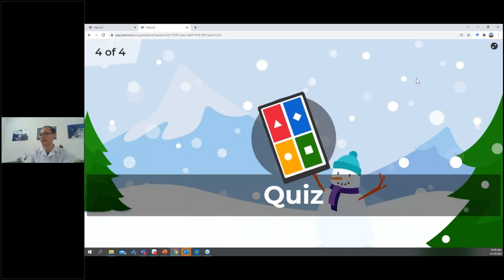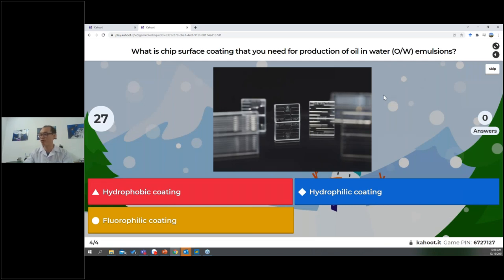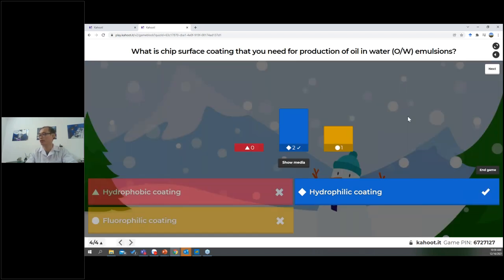Okay, final question. What is the surface coating that you need for production of an oil in water emulsion? Hydrophobic coating, hydrophilic coating, or fluorophilic coating. Remember that it's an oil in water emulsion. We have 10 seconds left. Four, three, two, one, time's up. Now we got three answers: two answers are hydrophilic coating, and one answer is fluorophilic coating. In this question, hydrophilic coating is the right answer because we make an oil in water emulsion, so the water is the continuous phase. It needs a hydrophilic coating to generate an oil in water emulsion.